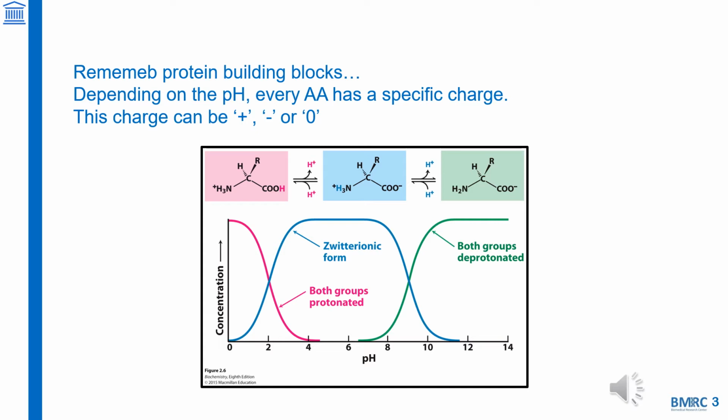This principle is used during SDS-PAGE. Before the sample is loaded into the gel for electrophoresis, it is given a compulsory negative charge by adding negative compounds such as sodium dodecyl sulfate, known as SDS, to the protein.